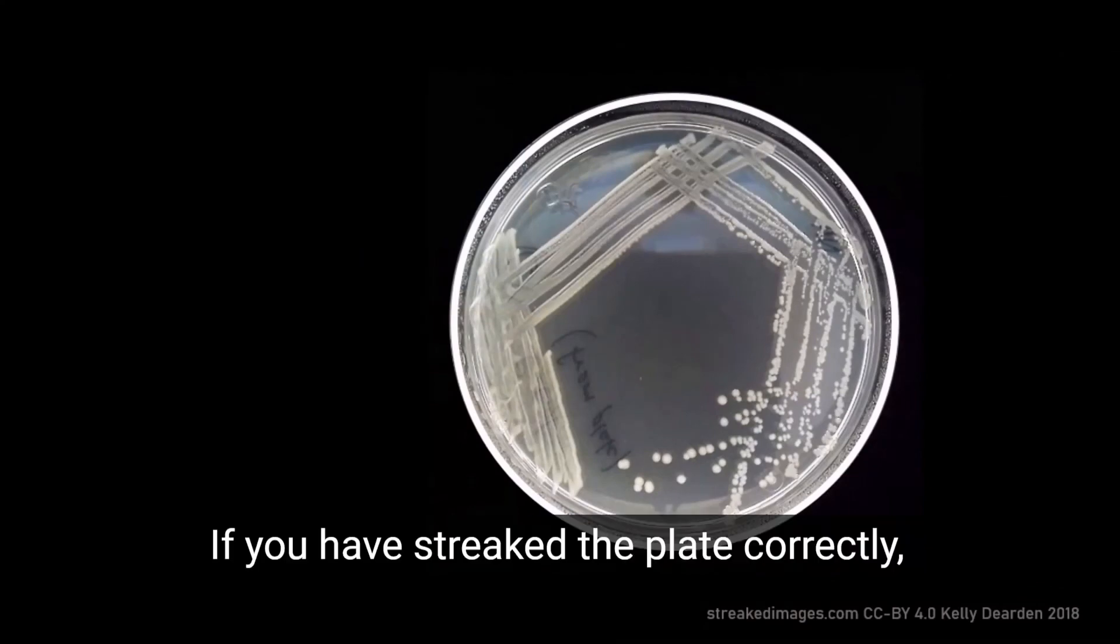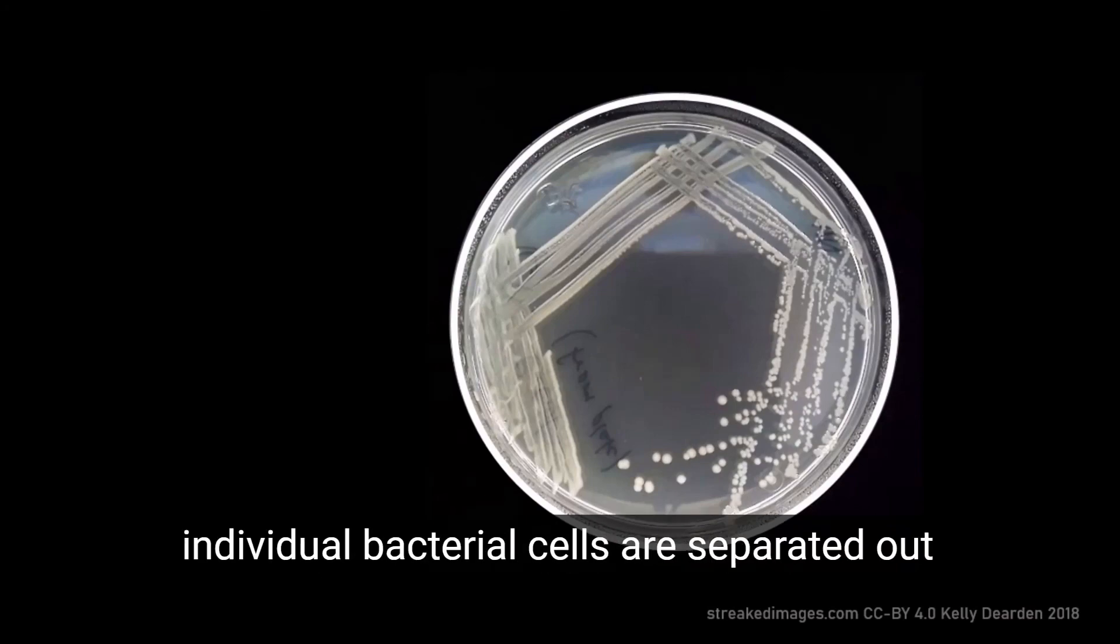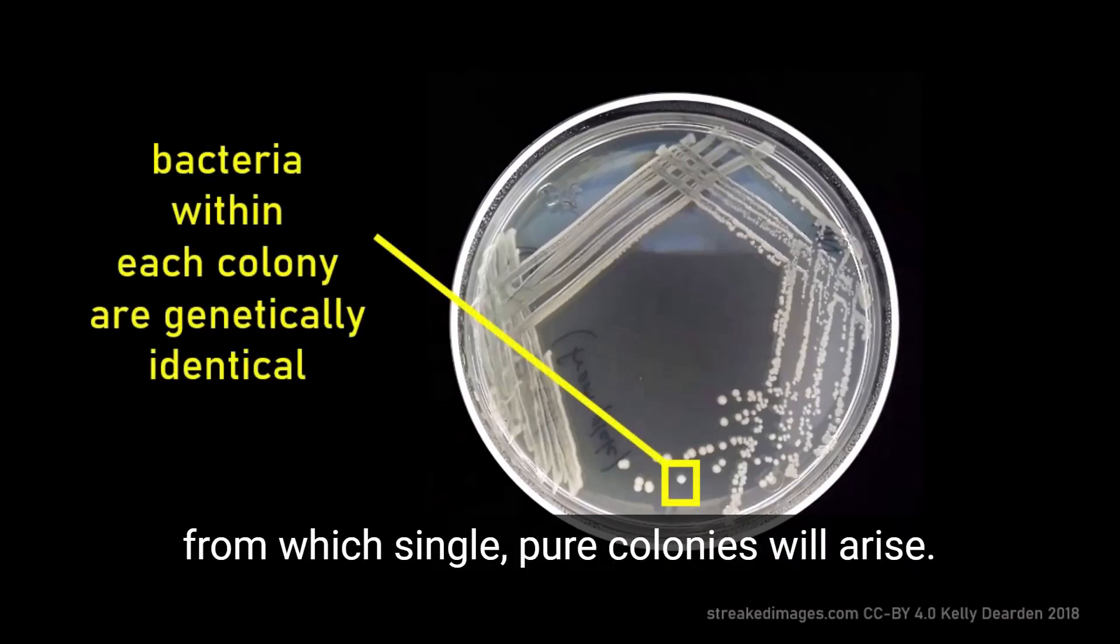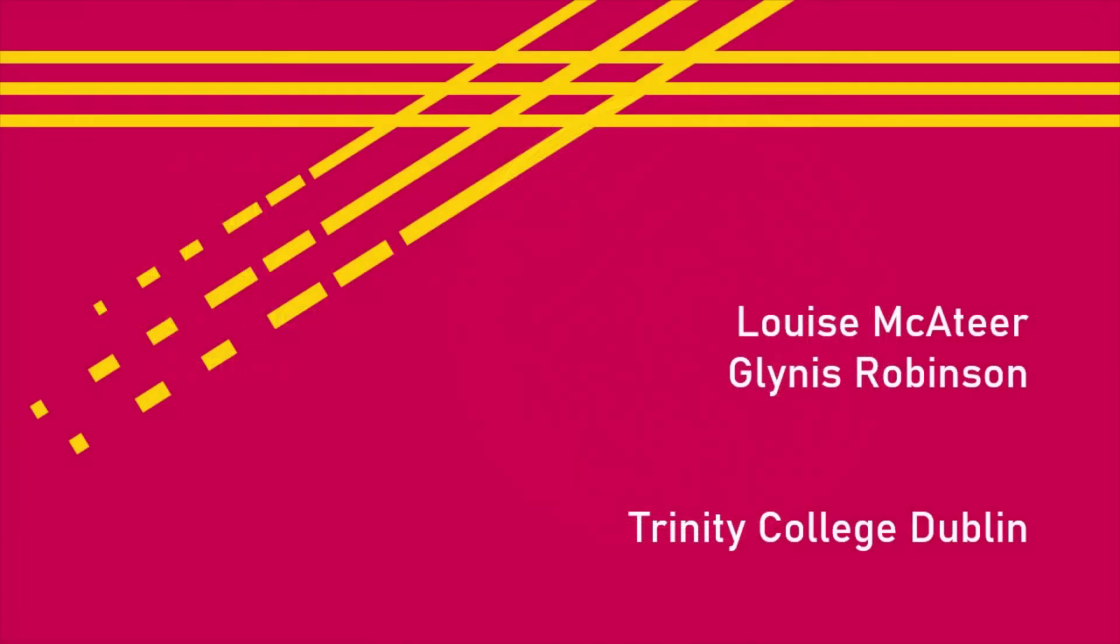If you have streaked the plate correctly, each successive streaking step dilutes bacteria further until, at the final step, individual bacterial cells are separated out on the agar from which single, pure colonies will arise.